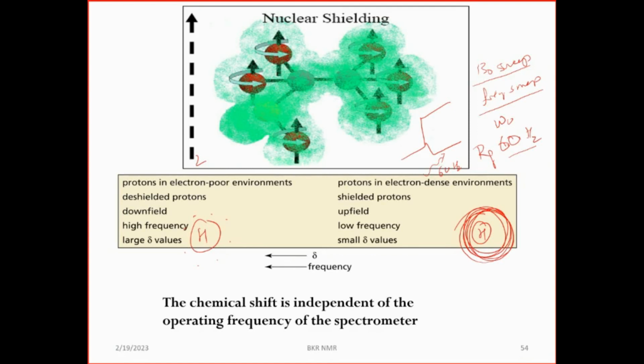That is the condition. What did I do with the field? I am following the field sweep method. I keep sweeping the field. For example, suppose I receive a field of 5 Tesla, there is a condition that I will precess at 60 hertz. All of these are analogies, guys. Suppose I receive a field of 5 Tesla, I'll precess at the precession frequency of 60 hertz.